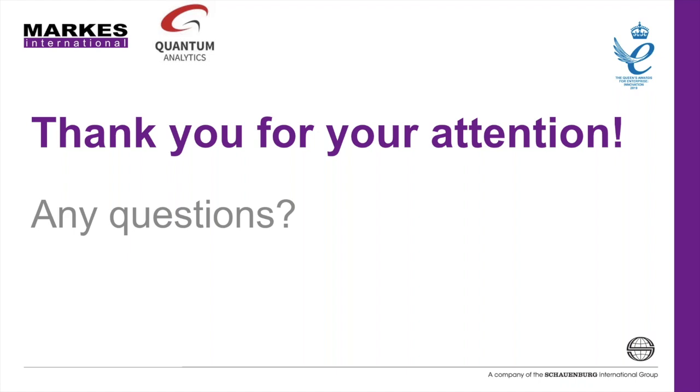You can save your sample for a later date. So say if the sample is very valuable, you've gone to the Amazon rainforest, you've trekked all the way there, you've got bitten by mosquitoes, you've taken your sample and you get back to your lab. Now you only have one of this sample and you don't really know what's on it. So by using recollection, you can analyze your sample, but also make sure that you can keep it at the same time. So if you do need to go back and look at that sample again, you still have exactly the same sample as you started with.